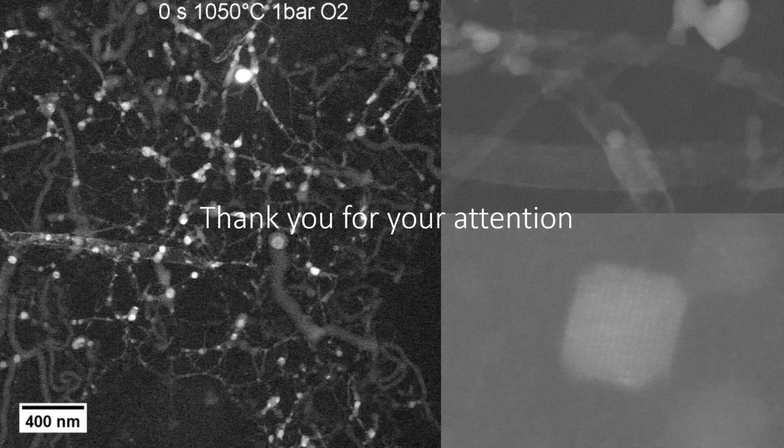The first question that we have is coming from Leonardo Lari, and he's asking, what are the conditions that you use during the resolution test, in terms of temperature and gas pressure, that gave the 65 picometer resolution?